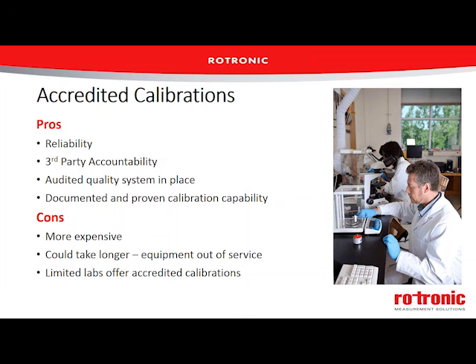I will say though that just because a calibration is accredited does not mean it's got the lowest uncertainties. All it means is that there are uncertainties there and that those uncertainties have been proven to be a good estimate for the particular process used. So accredited calibrations can vary in their overall uncertainties.